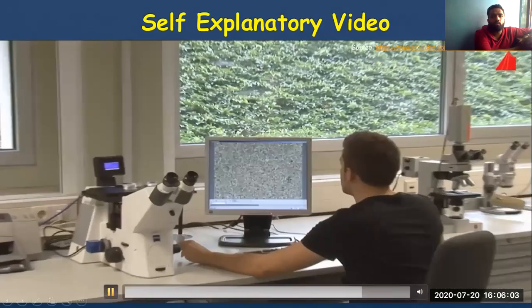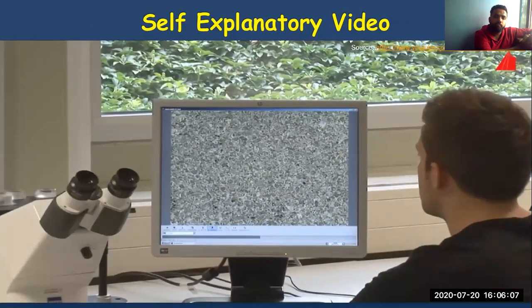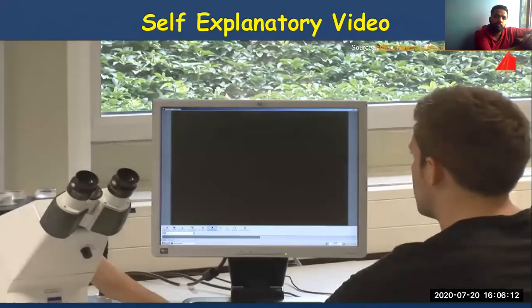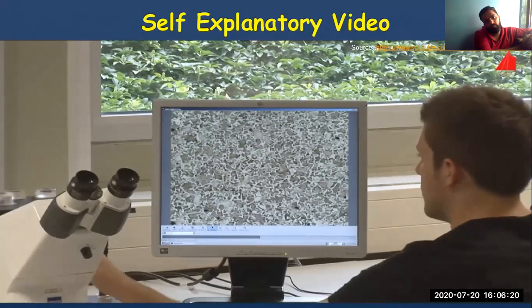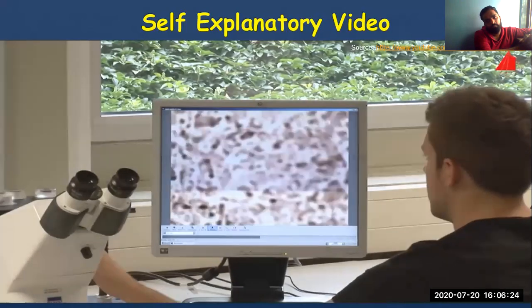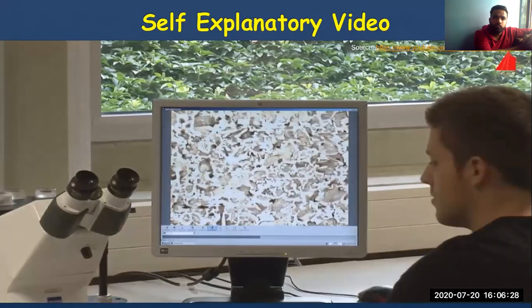We are just about to end. You can see, at low magnification, not much can be seen, which looks characteristic. The tester gradually switches over to higher magnification. In between, he focuses and adjusts the brightness. At medium magnification, light and dark areas become visible. At comparatively high magnification, in some of the dark areas, fine stripes may be recognized.